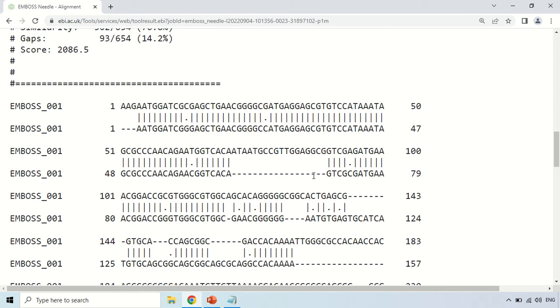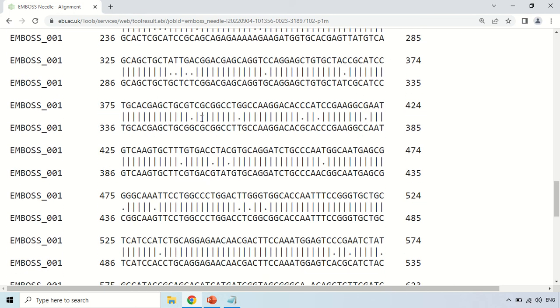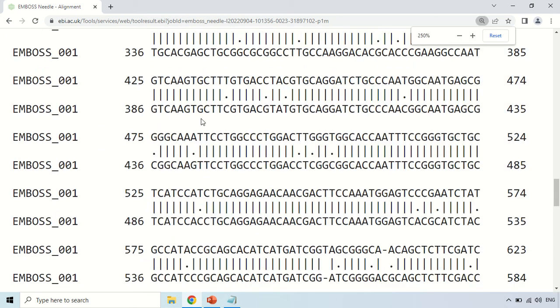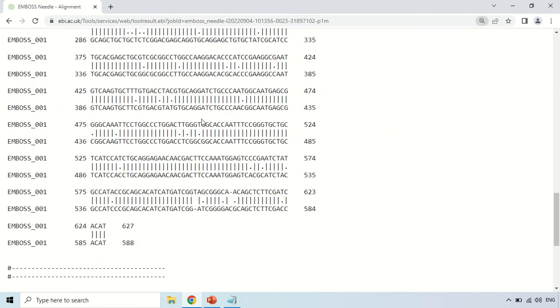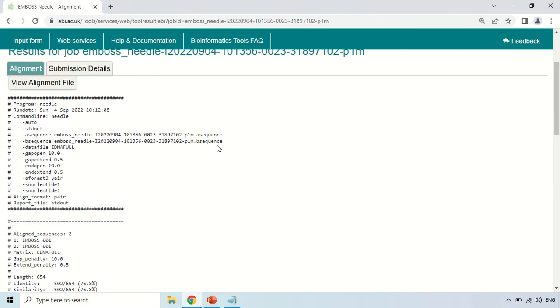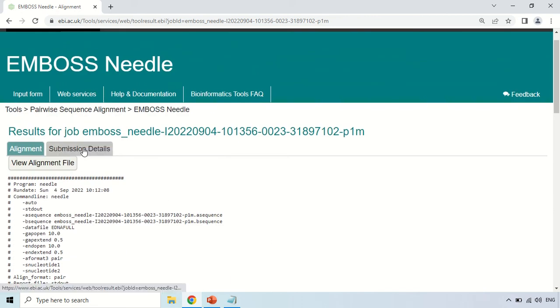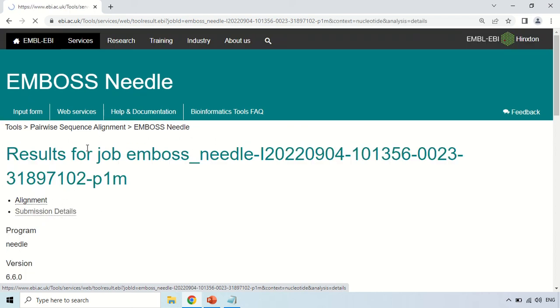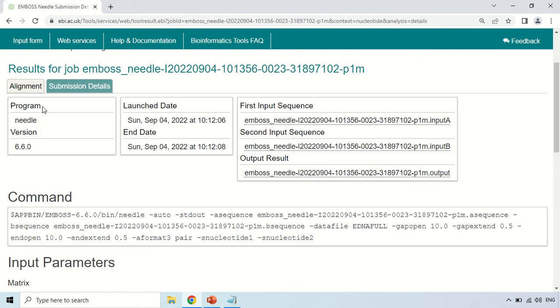If you see dotted lines, these represent gaps — meaning there is no corresponding nucleotide in the second sequence at those positions. By this you can interpret and understand the results given by EMBOSS Needle. Under the submission details section, if you click there, you will see information such as the program run was Needle, version 6.6.0.